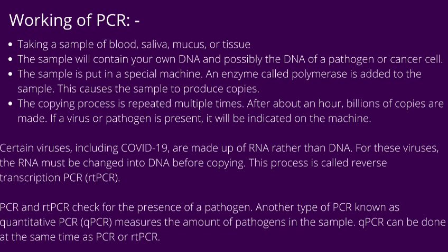Certain viruses, including COVID-19, are made up of RNA rather than DNA. For these viruses, the RNA must be changed into DNA before copying. This process is called reverse transcription PCR, RT-PCR. PCR and RT-PCR check for the presence of a pathogen.